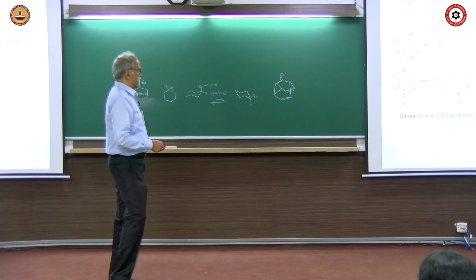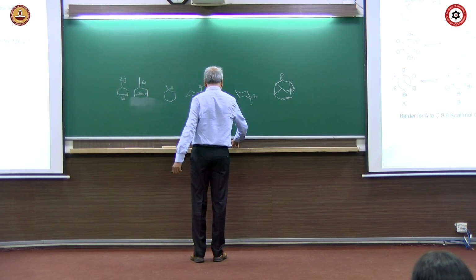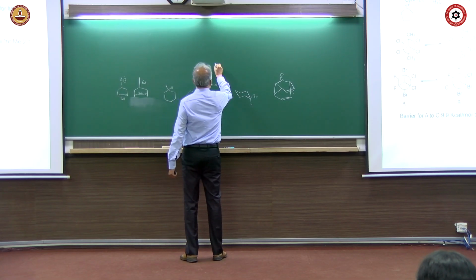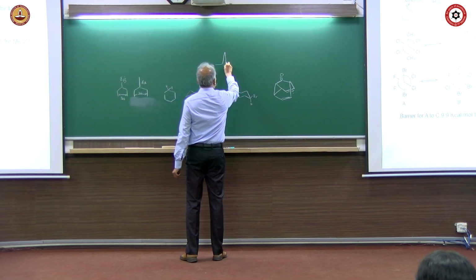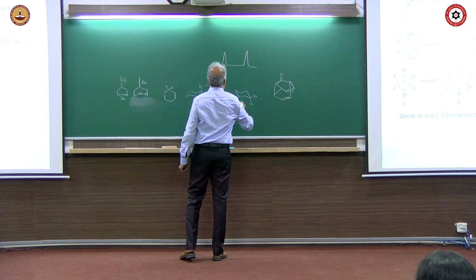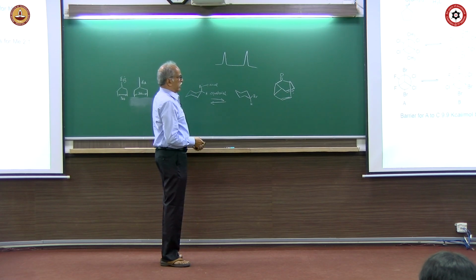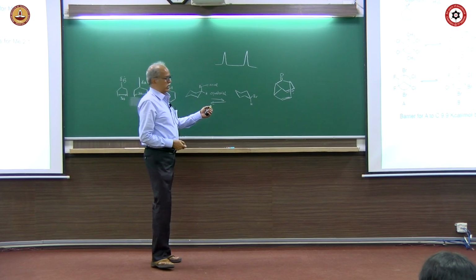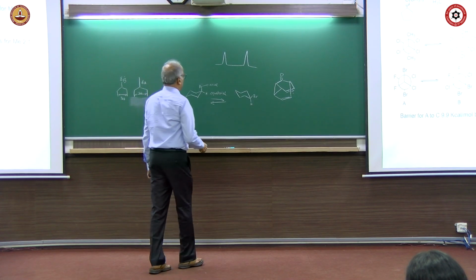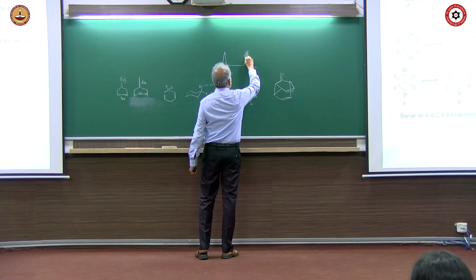And if I take the integration, let us say, I have one peak for the gauche conformer and another peak for the anti conformer. This is possible only when you do it at low temperature, -44. And it says it is a 2:1 ratio. The area under these peaks is 2:1.